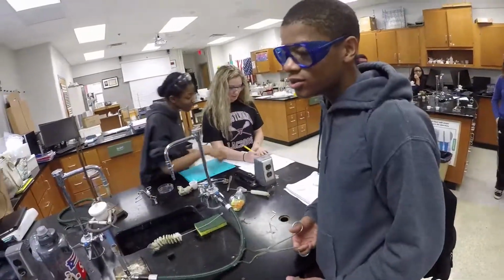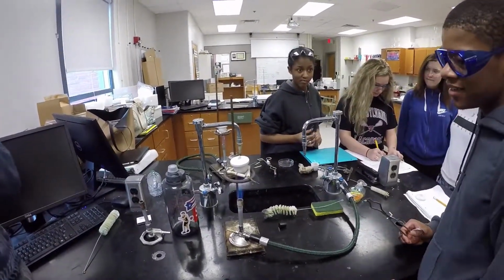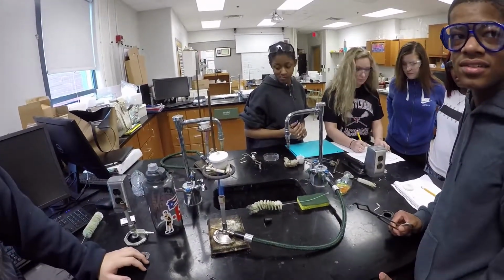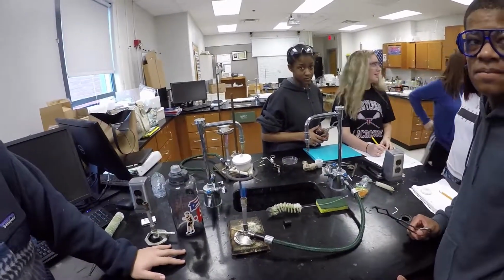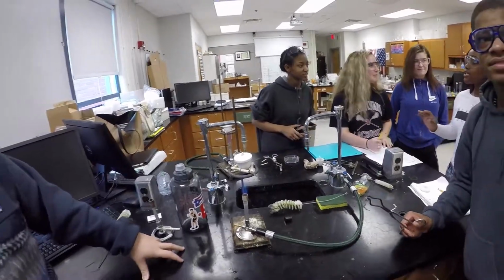Now, as the magnesium interacts with the oxygen in the atmosphere, we burn. You're adding energy, ionization energy, to the magnesium. So when you take that lid off, it's going to get really bright. That's because the oxygen is attacking. Oxygen is very aggressive. You don't want to look right at it because it could blind you.